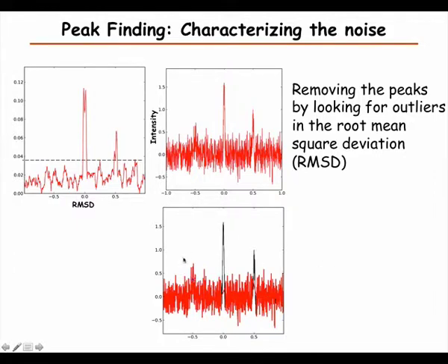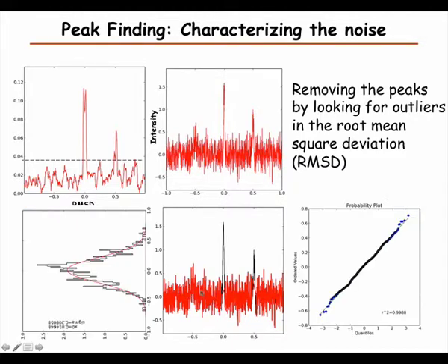So again, with this way we didn't detect this third peak here because it's very small. But now if we do the same thing, we see that we get a nice Gaussian distribution. We started out with generating normal noise, and we can now fit a Gaussian and see that we actually get back, sorry, this is upside down, but the sigma is 0.2 and the x0 is close to 0, which was what we started with.